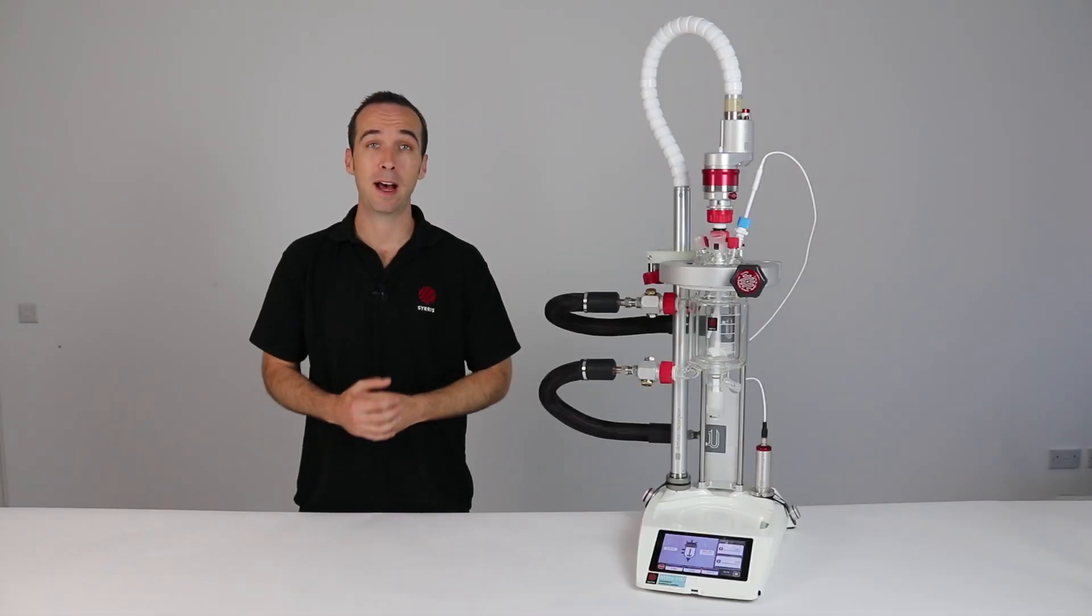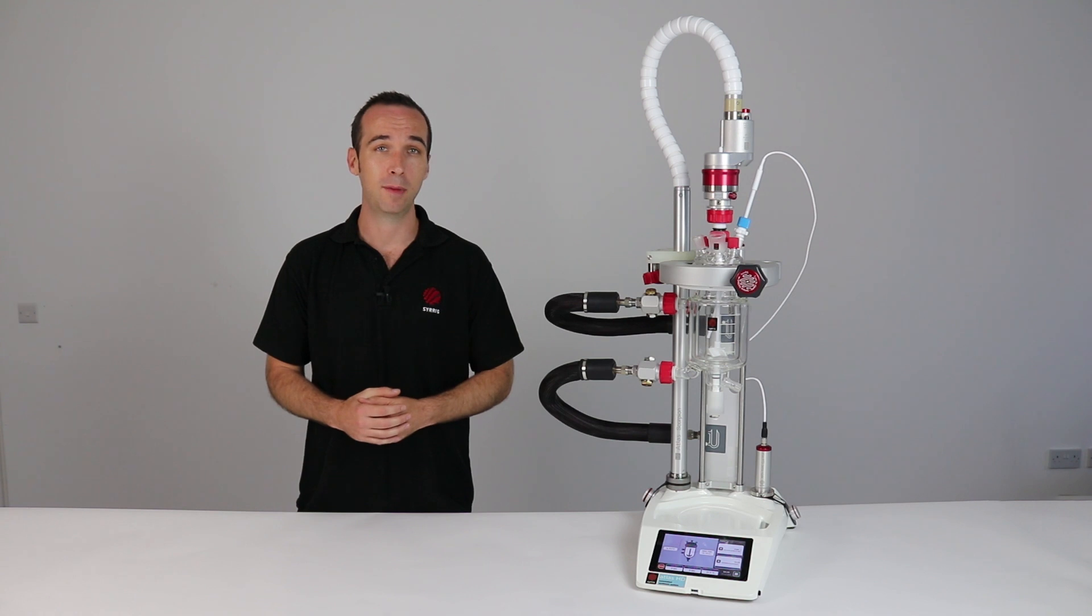So Atlas HD is a powerful, easy-to-use automated reaction platform used by process development chemists around the world. If you would like more information or if you'd like Syrris to assist in automating your process, please visit syrris.com or email info@syrris.com for more information.